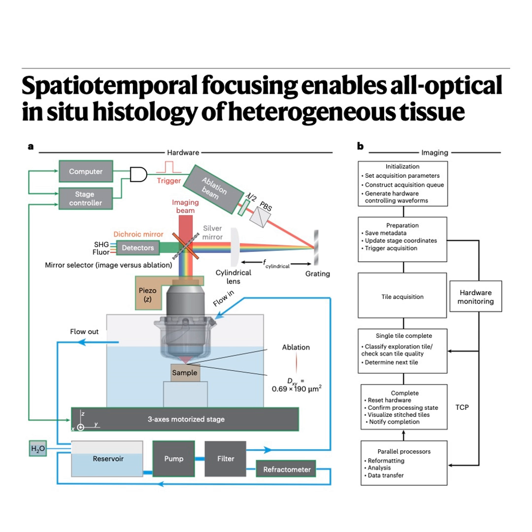They needed active control. How did they achieve that? Did someone have to manually check the RI every hour? That's the ingenious part. They built an artificial vision-based feedback control system. Completely automated? Artificial vision. How? Okay, get this. They route the circulating immersion fluid through a standard digital refractometer, which measures the RI continuously.